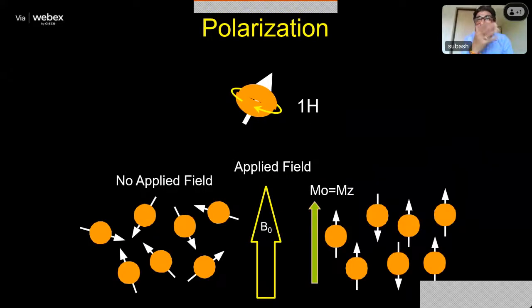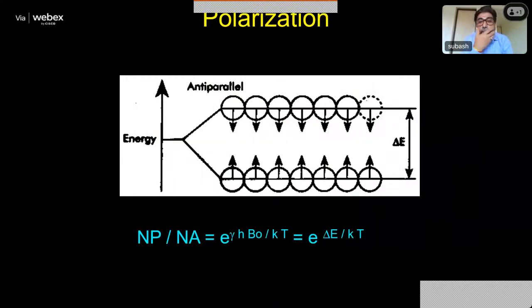This is what happens in an NMR experiment. You pump in radio frequency energy into the lower energy state nuclei and make them flip from the lower energy state to the higher energy state. And when they jump back to acquire thermal equilibrium, they release the energy, which is the basic NMR signal. I think this is what by now you must have learned from my predecessors.